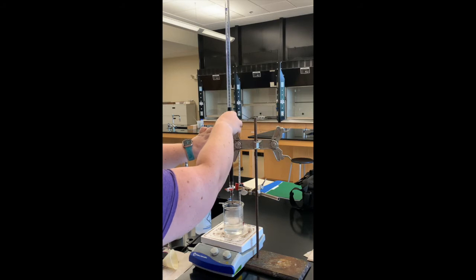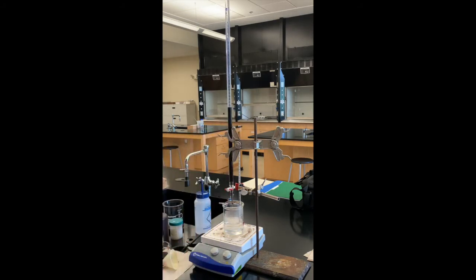So the titration is going to go the same as it did in Part B. We're still looking for that color change. The only thing that's changed is our sample that we dissolved in the acid is now an unknown. So you're going to figure out how much oxalate is in that.